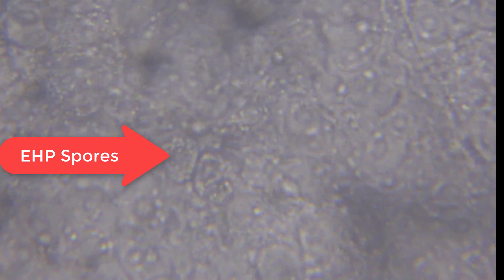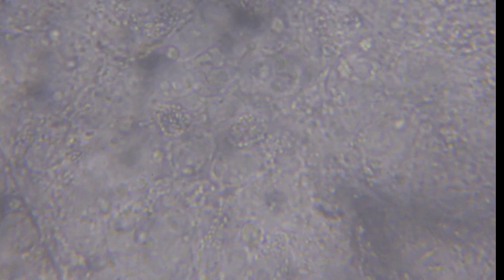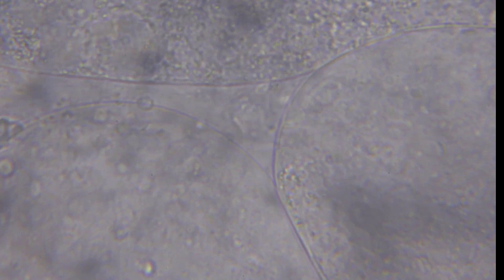EHP is an intracellular pathogen — specifically, it is intracytoplasmic. You should be able to identify the cell and the nucleus. The EHP will be in the cytoplasm; it won't be in the nucleus. There are several spores here, and this is a very severe case. You can see all the EHP spores spread throughout.